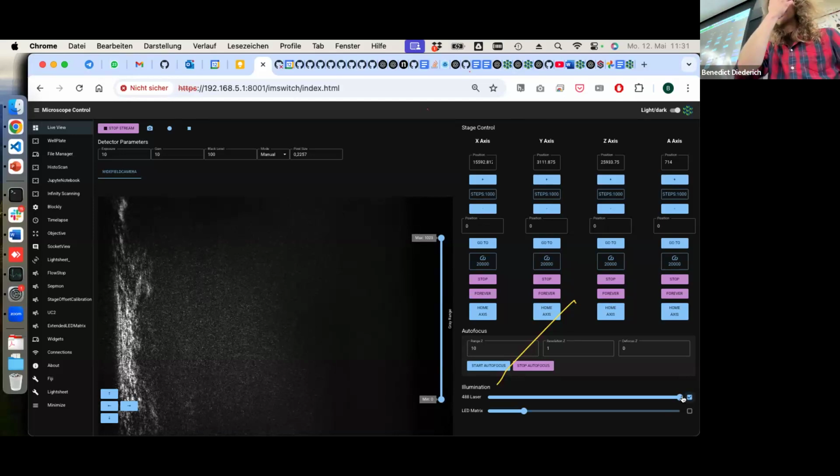To build a light sheet microscope, you have light coming from the side, you illuminate the sample, you move the sample in X, Y, Z, and then you have a microscope, which is basically a fluorescent microscope capturing that from the side here. On the other table here, you have the interferometer, exactly what you see there on the screen. Here it's a laser. You have the mirror. One fraction of the light goes here, one fraction goes there. So you turn on the laser and you actually see two copies of the light, one coming from this arm, the other from that arm.